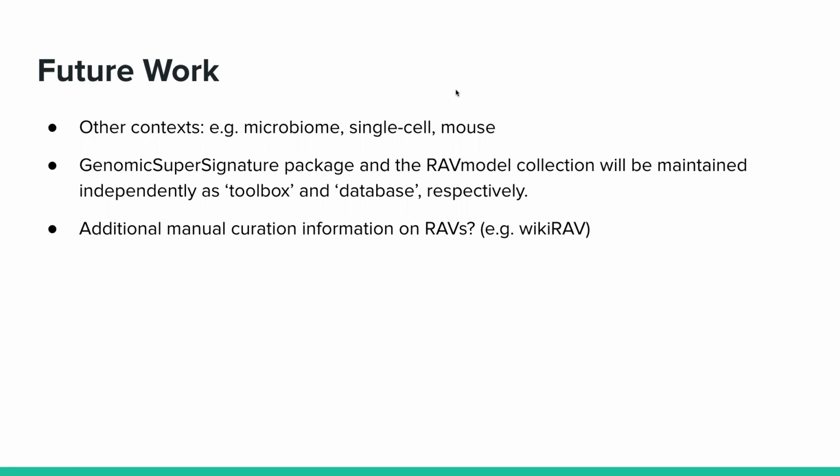You just ask whether your principal component is related to any of these other features of the experiment. If you have one driven by age or experimental conditions and somebody else matches on that, they've potentially just found that demographic feature again, not something that's intrinsic.